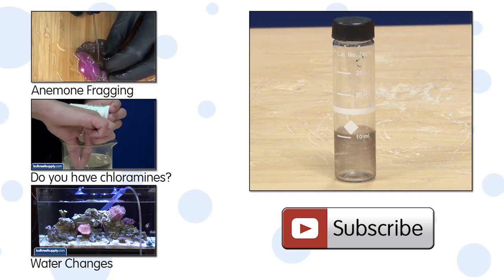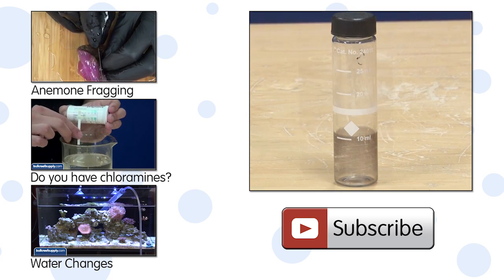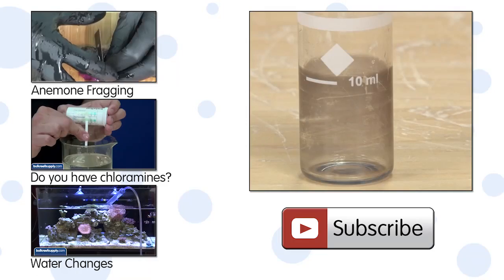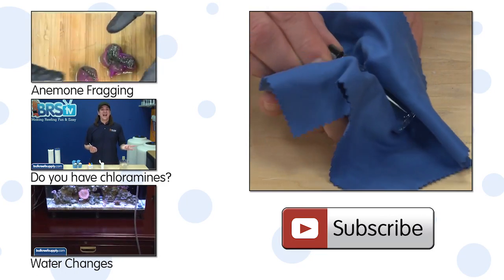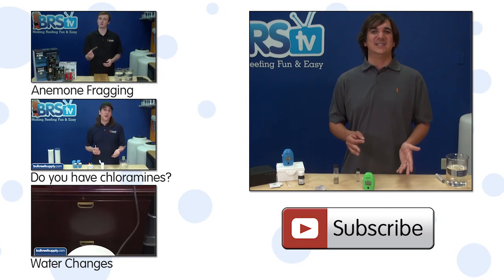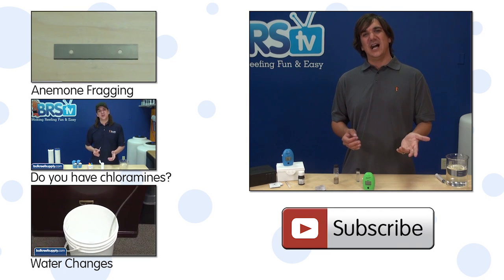A couple of quick tips on doing these tests: it is critical that you rinse the cuvettes out when you are done so the reagent dye does not permanently stain the glass. It is also important that the glass cuvette is clean and free of fingerprints. If you have any questions or advice on these or other checkers, check out the comments area down below.